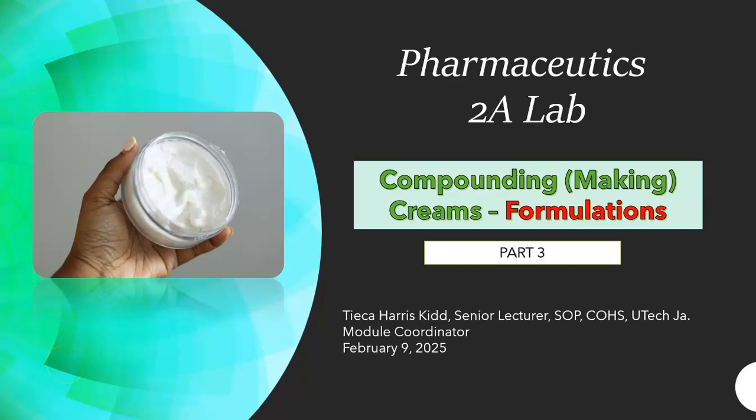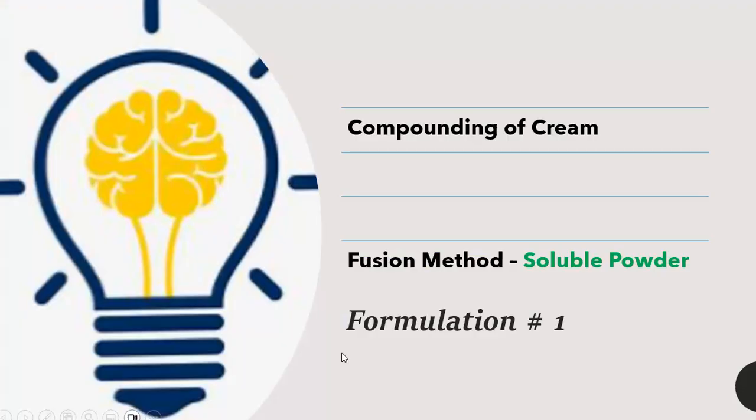Welcome to the third part of the series in compounding cream formulations. In this part 3 video, we are going to look at specific examples and the formulation as well as compounding principle. If you have reached this stage, that means you have watched video 1 and video 2.